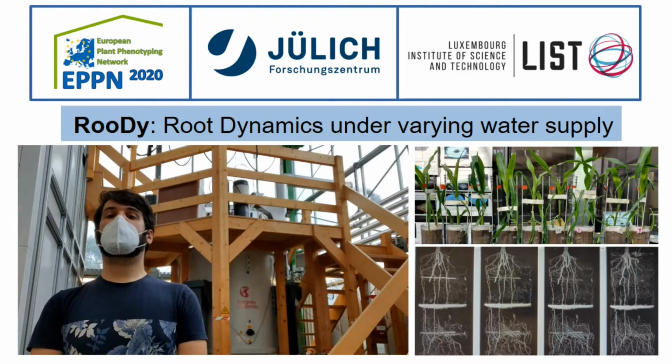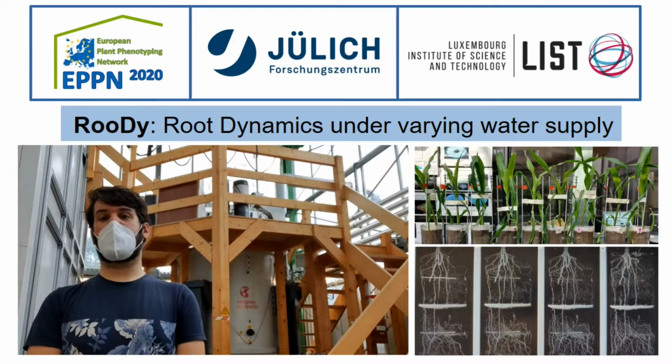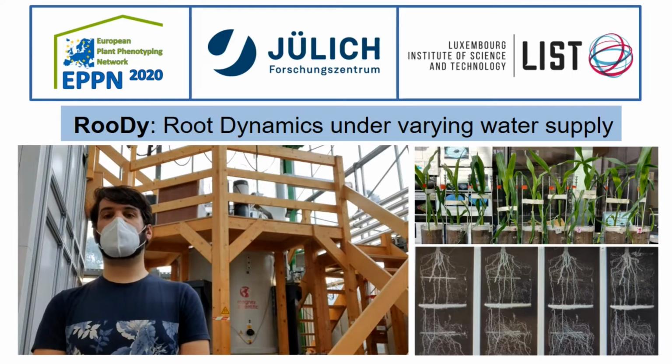Currently, I am in the Jülich Forschungszentrum, where I carried out my experiment about root dynamics and the varied water supply. I was able to carry out the experiment here thanks to the European Plant Phenotyping Network. Let me show you what my experiment was about.